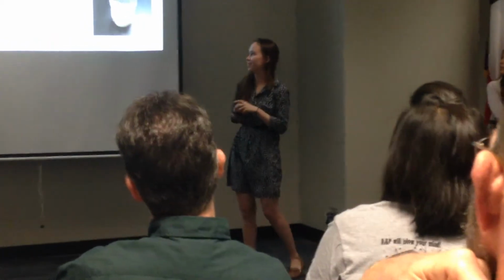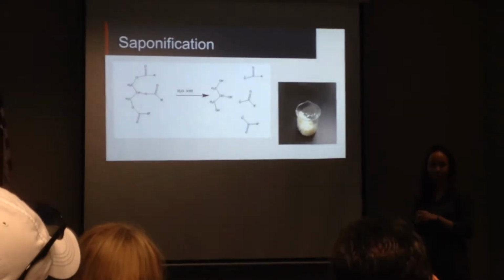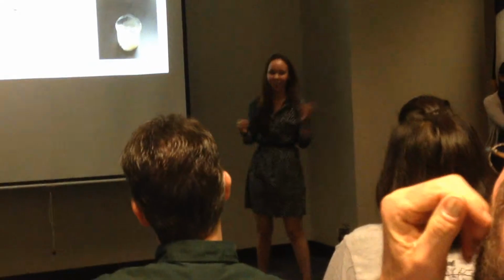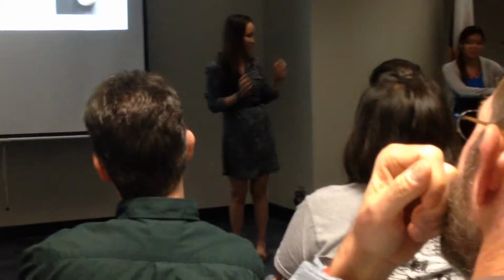And this is what happens whenever you still have water inside your fat and you get soap, which is really upsetting because then it failed. And it's hard to get all the water out. And the reason we do this is so we can analyze it by gas chromatography, which Nikki's going to talk to you about.